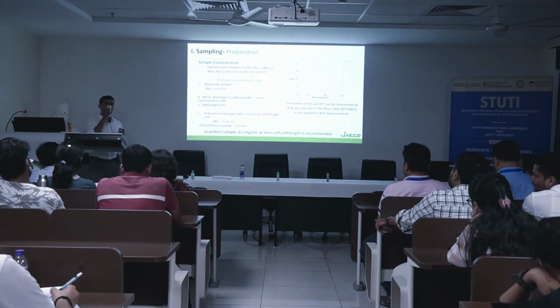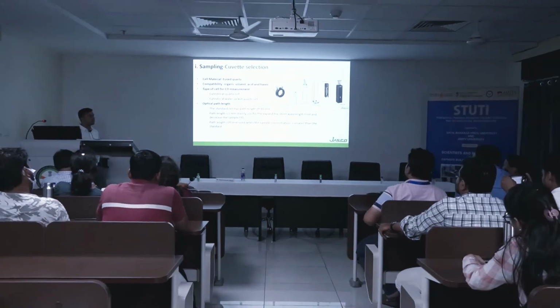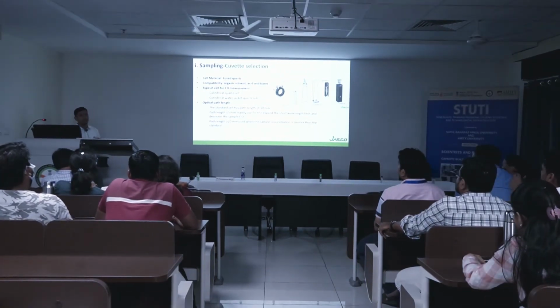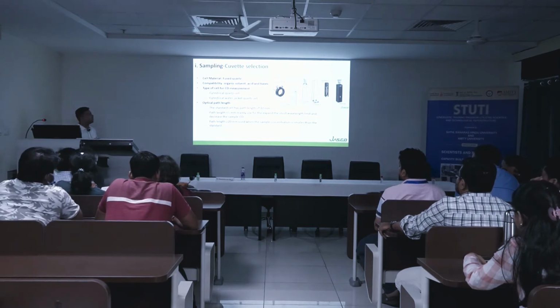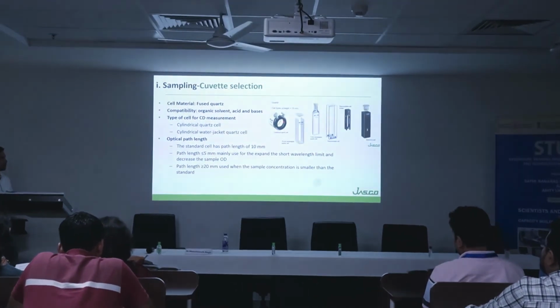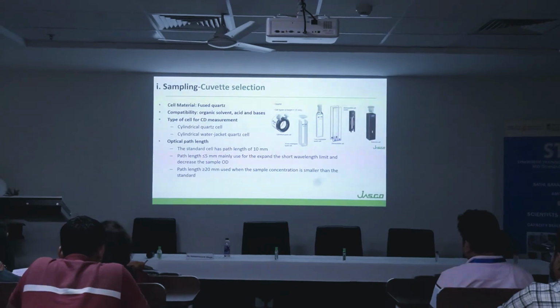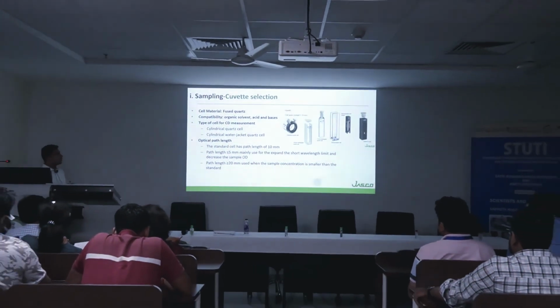When you work in the UV region from 190 to 250 or so, you will require quartz cuvettes. Different path lengths of quartz cuvette are available for different applications.